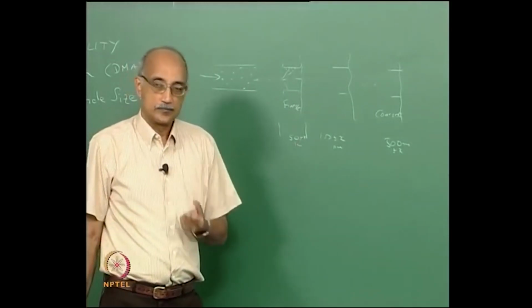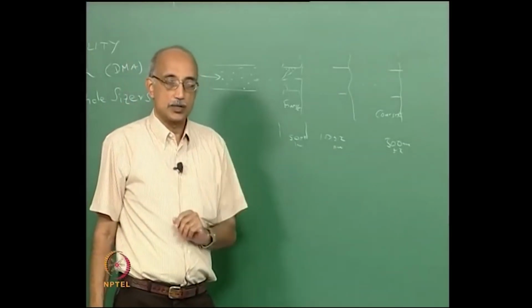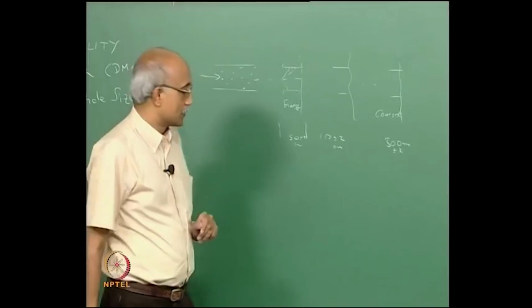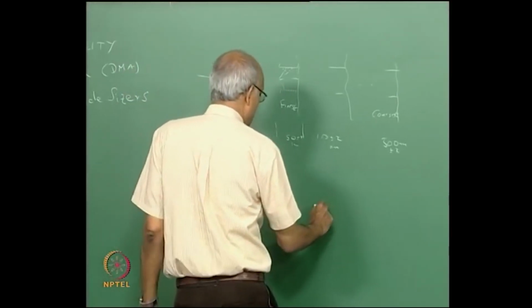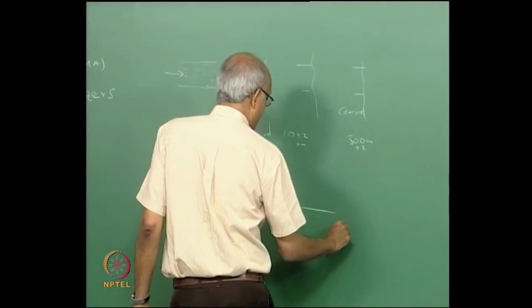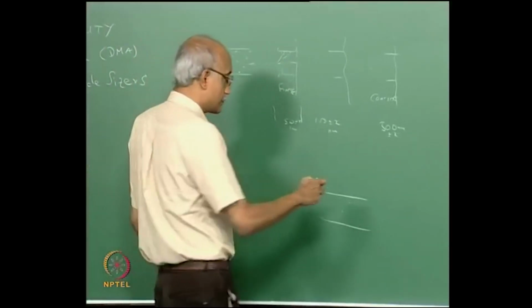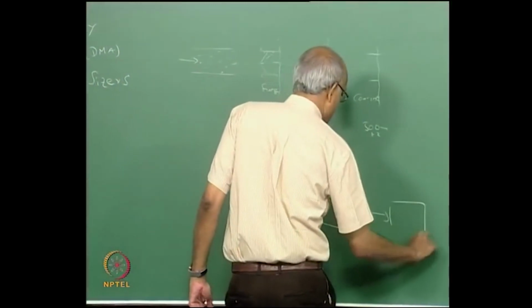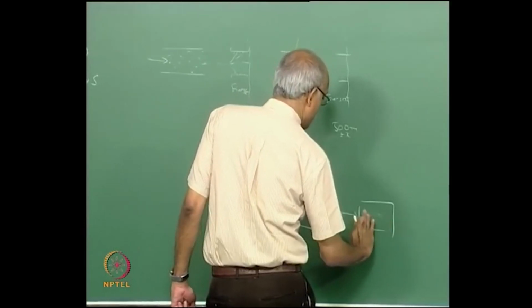So, how do you incorporate this within the condensation nuclei counter that we talked about last time? If you recall, the condensation nucleus counter essentially takes a stream of particles and it actually condenses material on it. So, you have a condenser stage. Well, actually first you do a saturation.